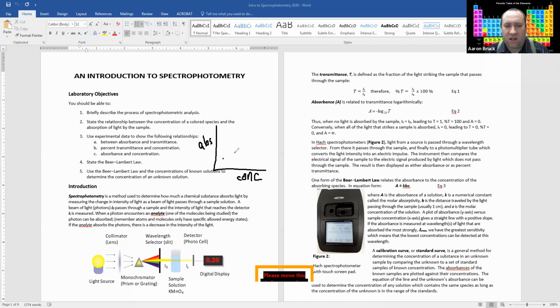And the results that we get should be relatively linear, where we can plot a scatter plot and a trend line to tell us the exact relationship between the two variables.